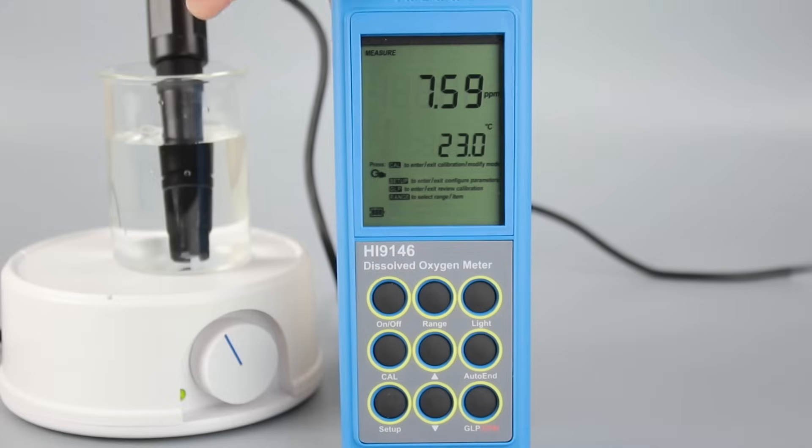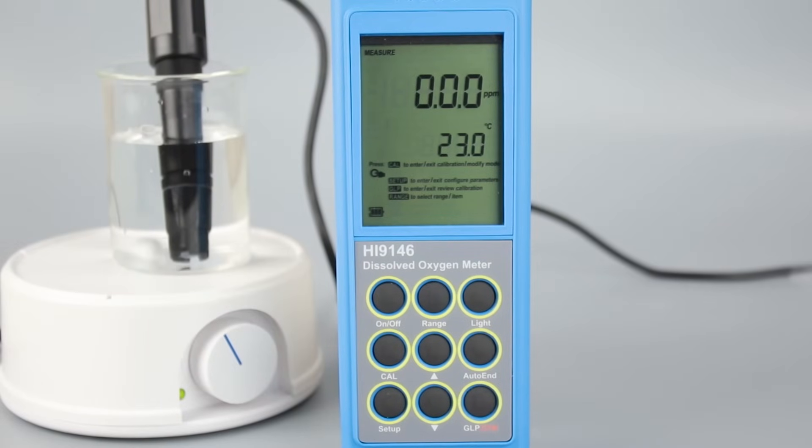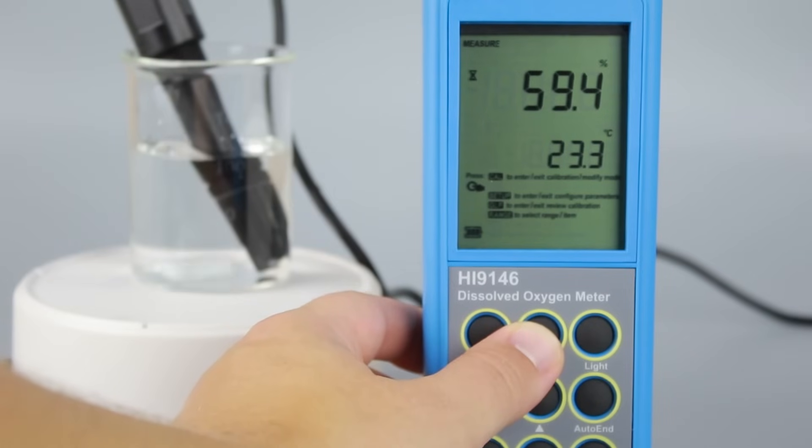Once your meter is calibrated, you are now ready to begin taking measurements. Simply submerge the clean probe into the sample you'd like to measure and stir. You can use the range button to cycle between ppm and percent units. Since the DO probe consumes a small amount of oxygen while it operates, it's important to stir to avoid falsely low readings.